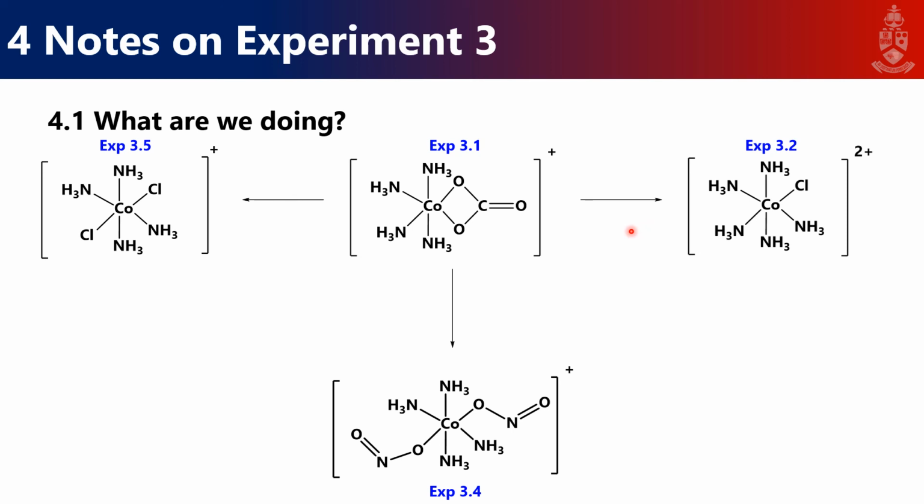You can read it in the practical manual. And of course, in principle, you need a gram of this over, because in principle, you do IR and you do things. Even though you won't be doing that yourself, the data has already been collected for you. But, in principle, you need it. So you need 3 grams, but you need 4 grams of yield. Okay.